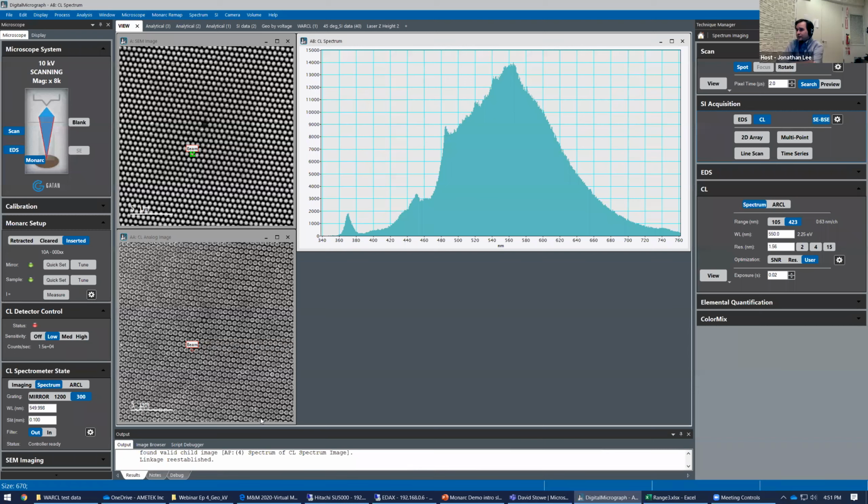To refine, it's an imaging spectrometer, first of all. So it's not like a typical Czerny-Turner that you might be thinking of. But essentially, the more light that you can reject, the more specific the light that comes in becomes. And it also limits field of view. So that's the trade-off. The amount of light that can efficiently couple back into the system is being restricted by this entrance slit. So as I make the slit smaller, the field of view that you can actually acquire light from is shrunk. Okay, so it's a way of improving your spatial resolution then. No, it's improving the spectral resolution.